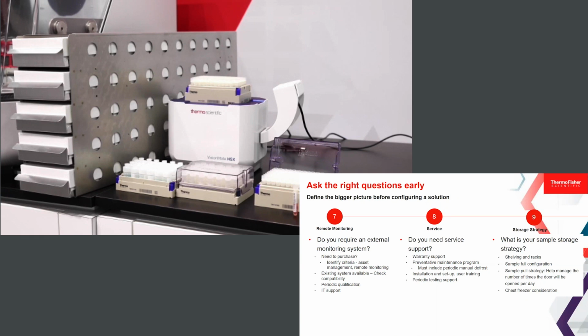Here in this view, you see the freezer rack. We've placed it on the counter here just to showcase it. But you can see it has those white cardboard boxes in there to help you keep your samples organized. So having a map on the outside of your freezer can be really helpful. But also think about more advanced solutions, whether it's dense storage that you want to look at, whether it's barcoding strategies so that you know exactly what you're looking for.